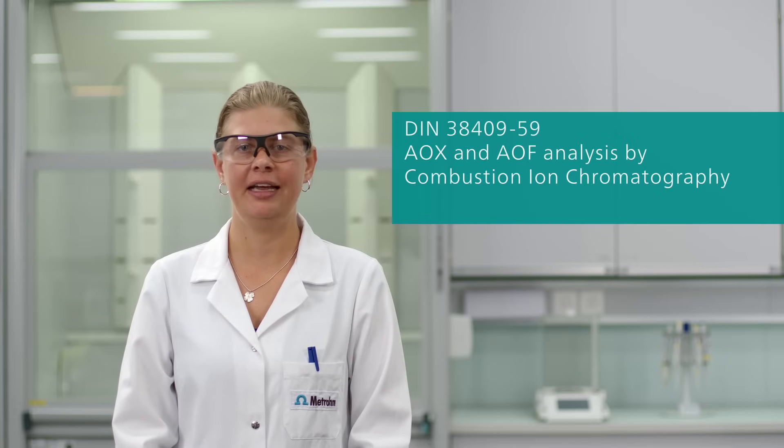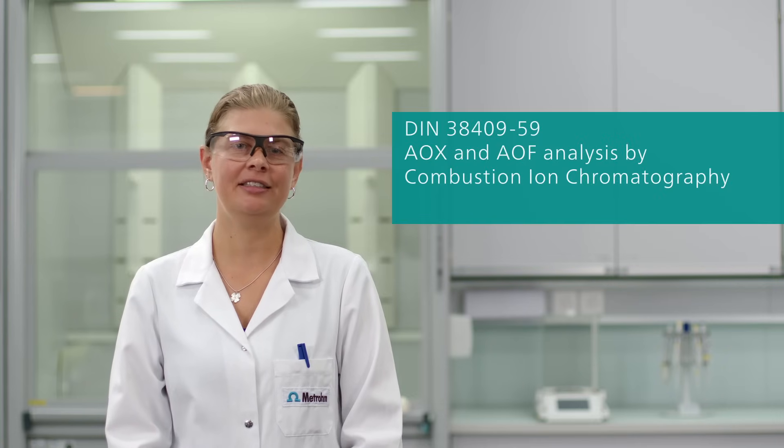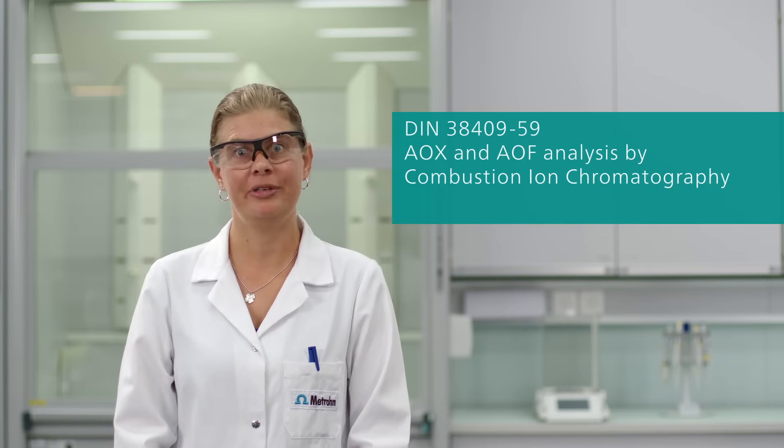The newly released and validated DIN 38409-59 describes this analysis using combustion ion chromatography.